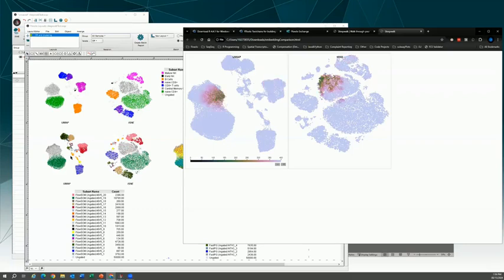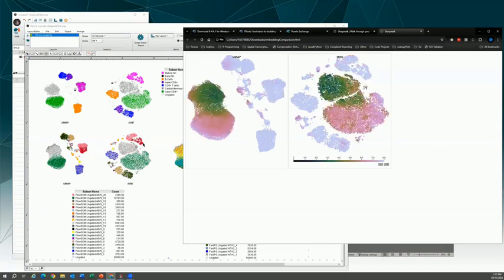So that would tell me I agree with these clusterings we get from FlowSOM, at least on this UMAP embedding. t-SNE is more complicated. There's all this additional local structure that, if we did some subclustering on these, we might pull apart some more detail that t-SNE can find, but the clustering didn't seem to capture.